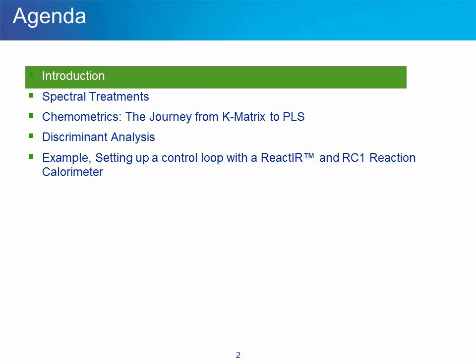Today's agenda will include an introduction, then a section on spectral treatments, a section on chemometrics, the journey from K-matrix to PLS, discriminant analysis, and an example setting up a control loop with a React IR and an RC1 reaction calorimeter.